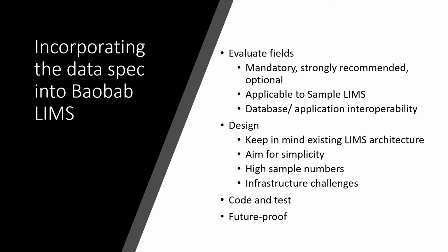Before we could incorporate the data specifications, we had a number of things to consider, and some items were already on our radar from previous experience, as well as valuable retrospective user input. Fields that were mandatory had to be added, but we had to evaluate the other fields to ensure the suitability for a sample LIMS. Baobab LIMS is not an NGS LIMS, and as such does not contain the quality metrics associated with sequencing and bioinformatics. However, we had to ensure some overlap because these downstream processes are in fact linked to the sample management processes.